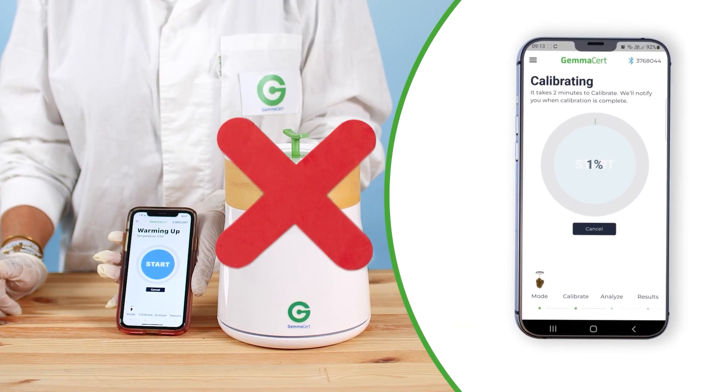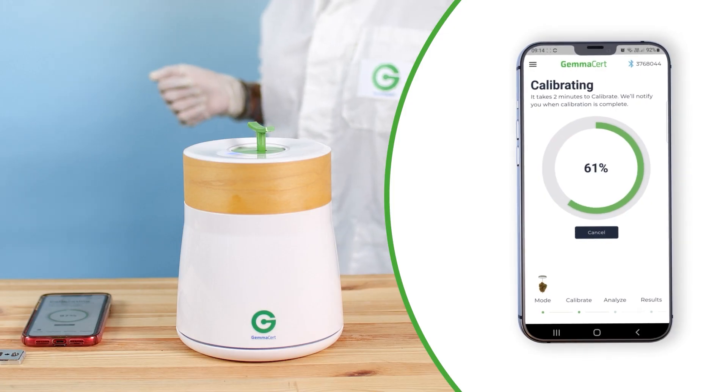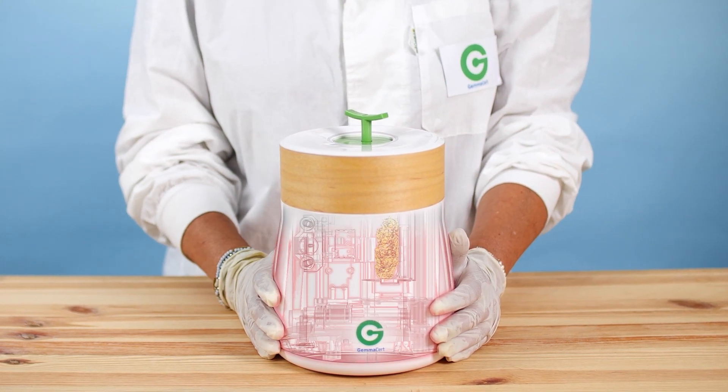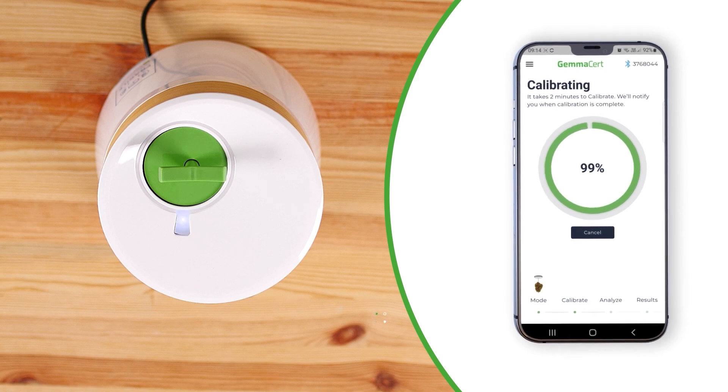Do not open the sample container during calibration. Do not touch the device or move it. Calibration will take a few minutes. If you are calibrating for the first time after turning on the device, there is a warm-up period. Calibration is complete when the power button turns to steady blue and you hear a beep.